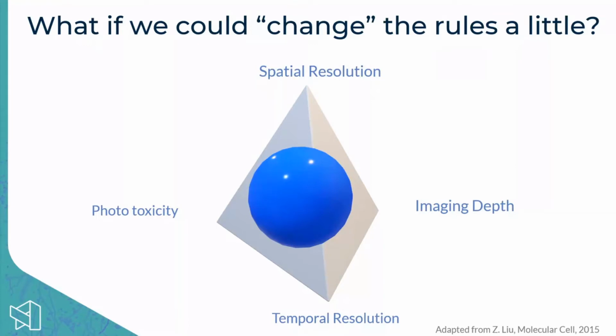So what if we could change that? And how would we change it? And that's something that we are very much engaged in, and we have a major NIH project ongoing currently called AIRS. That's AI platform for image restoration and virtual staining. That's the project that we're doing with Hari Sharoff and quite a lot of other people. There's, I think, 8 or 9 core facilities in the US that are helping us develop that platform.